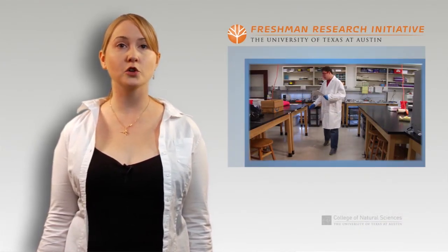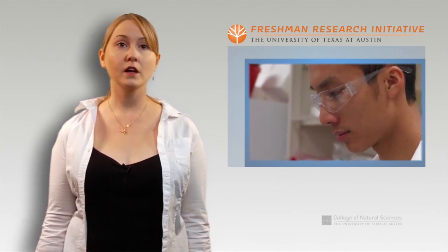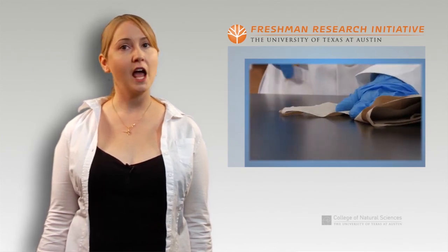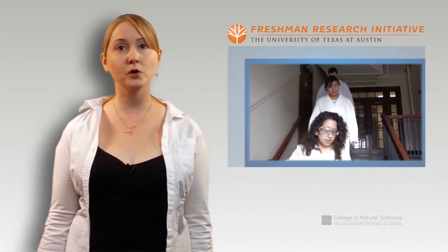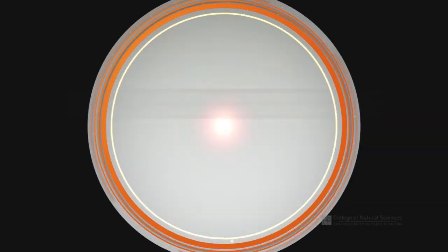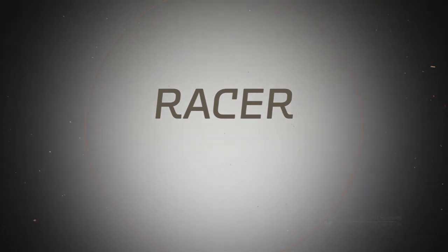Lab emergencies are serious situations, and your ability to deal with them will depend on your ability to remain calm and assess the situation. Your response may vary depending on the nature of the emergency and whether or not you are comfortable and able to contain the situation. Remember the acronym RACER and follow these steps when responding to emergencies.